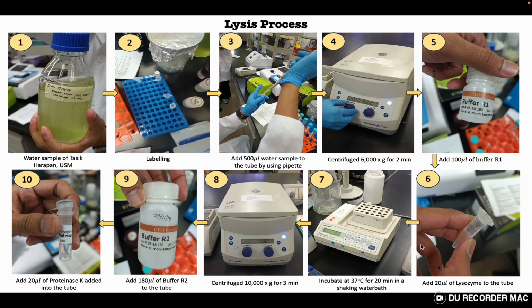Again, we centrifuge at 10,000 for 3 minutes, followed by adding 180 microliters of buffer R2 to the tubes. For the next step, we add 20 microliters of proteinase K into the tube. Proteinase K helps to make the cells break down.